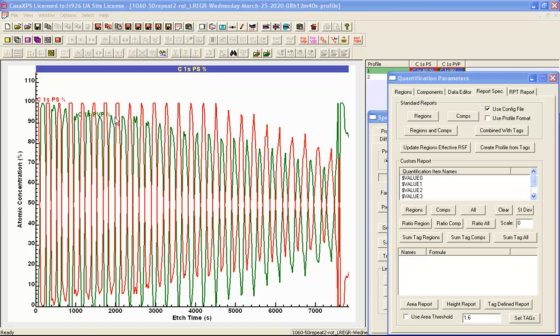So I will now go through and do the analysis again, where I will introduce more flexibility into the linear least squares approach, and hopefully produce a much better profile that is more representative of the layers of these different polymers that have been profiled using this argon cluster source.